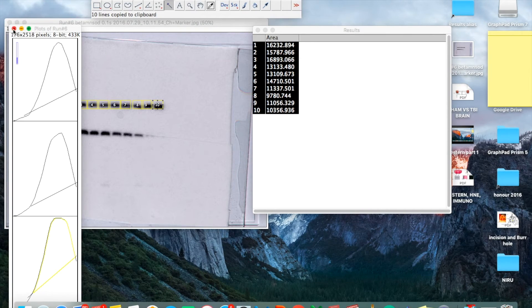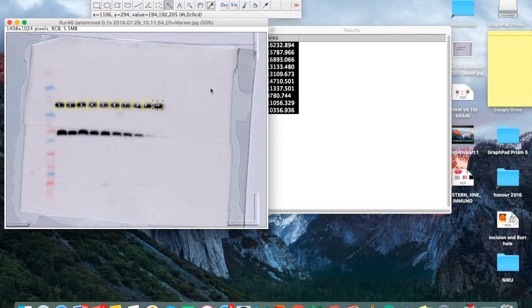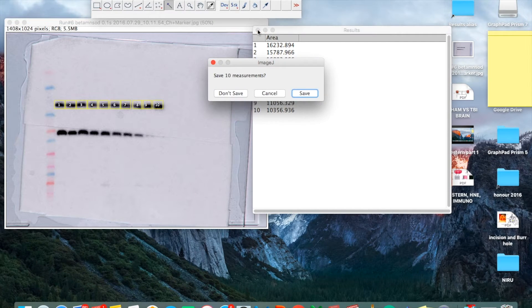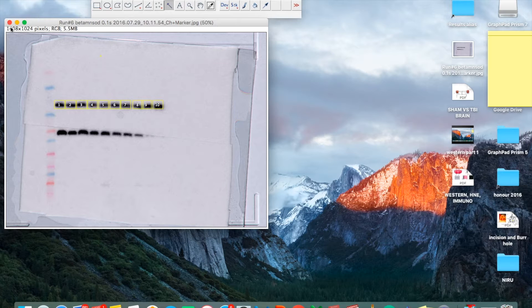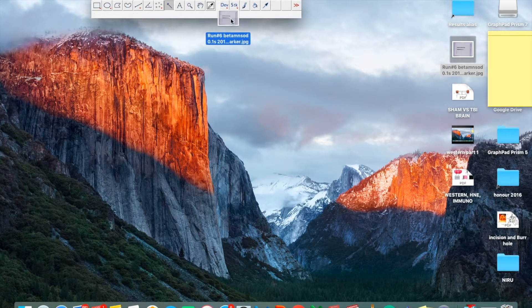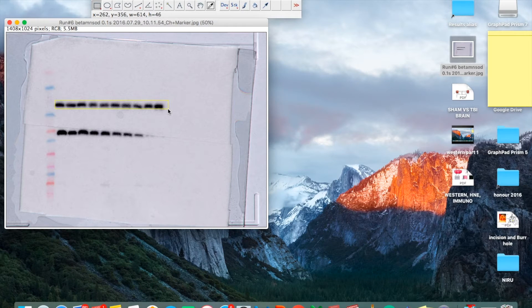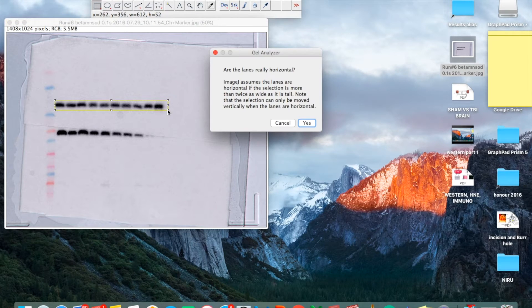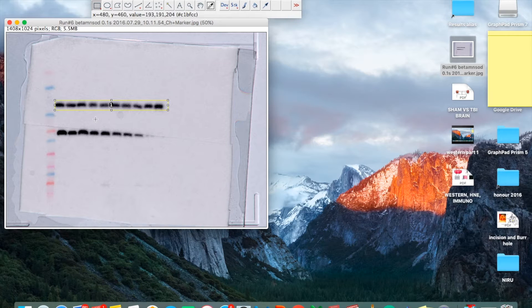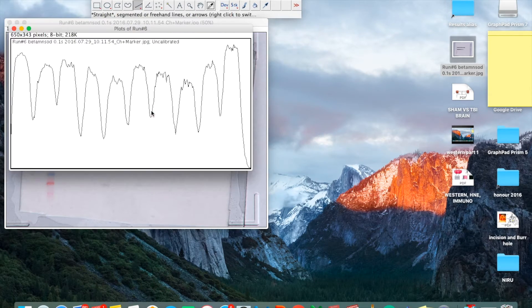Alternatively, you can use another method which is much faster. Drag the image over here and using the rectangular tool, select all of the lanes at once. Now press Command 1 and click Yes. This sets the first lane. Now press Command 3, and you will have all 10 lane peaks displayed — peaks 1 through 10.